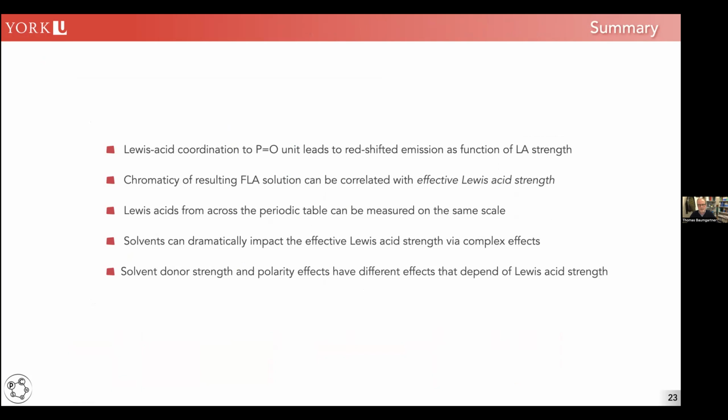All right, with that, I'm at the end, and I hope I could show you that we can use Lewis acid coordination to a PO bond that ultimately gives us a nice redshifted emission that we can then correlate with the effective Lewis acidity of the Lewis acid in solution, and we can measure basically the entire periodic table doing that.